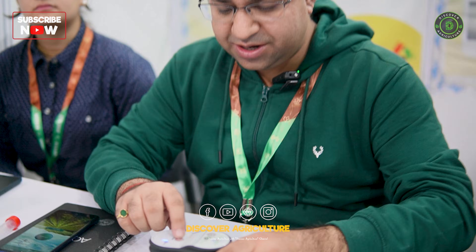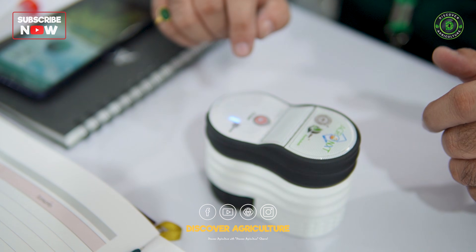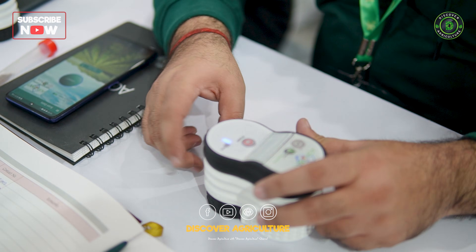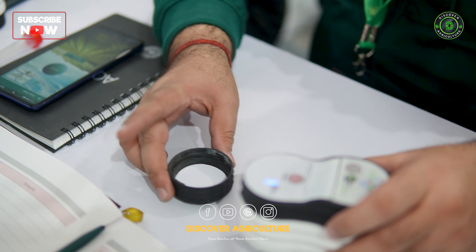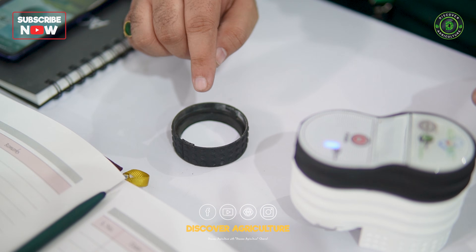This is the power button of the device, which can be used to turn the device on. Towards the bottom we have the soil cup — in this area we have to put the soil sample.